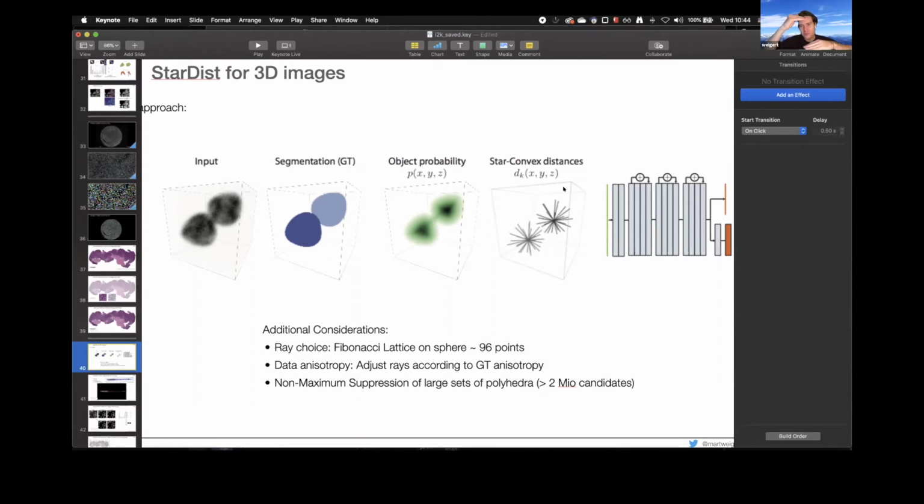So what we do is make sure that if you had a sphere in your Platonic world that is then prolated in your compressed stack, your points would be equally distributed on this prolated sphere. We distribute more rays on those regions that are hard to reconstruct in your stacks if it's anisotropic. So this is already factored in. We actually change the directions according to the anisotropy.